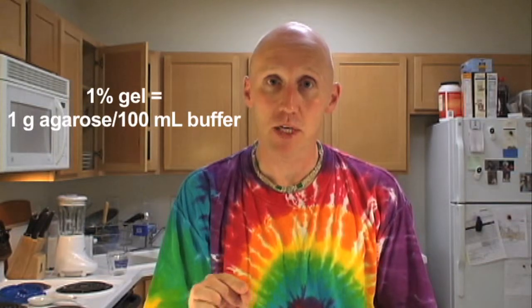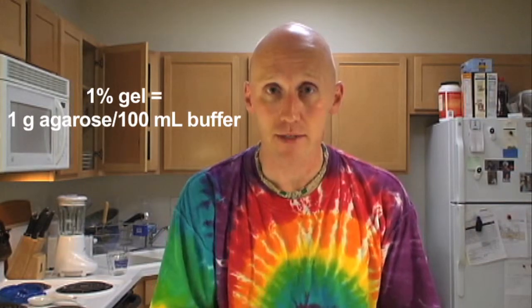In the laboratory, we end up weighing out agarose weight per volume. So a 1% gel would be 1 gram of agarose in 100 milliliters of your buffer of choice. Here, all I want to demonstrate this evening is that as you increase the percent gel that you utilize, the same DNA molecules will behave differently in those different percent gels. And what we're going to use here tonight is grapes. They're all basically going to be considered to be the same size of DNA molecule, and yet we're going to increase our percent gel. So let's get started.